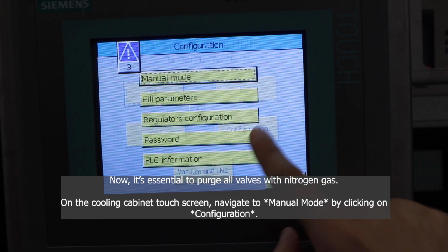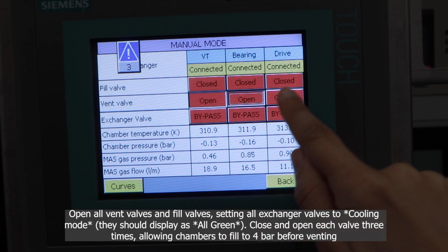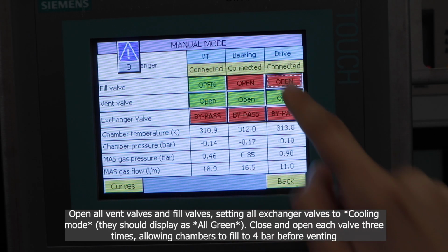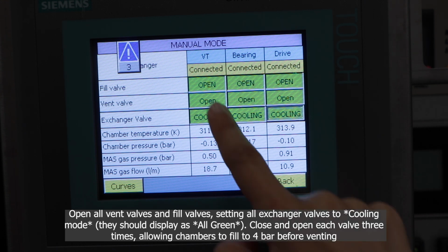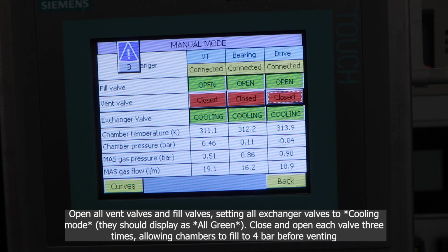Now it is essential to purge all valves with nitrogen gas. On the cooling cabinet touchscreen, navigate to manual mode by clicking on the configuration and open all vent valves and fill valves, setting all the exchanger valves to cooling mode. You could do this 3 times with cooling mode, and then repeat the same with the bypass mode.